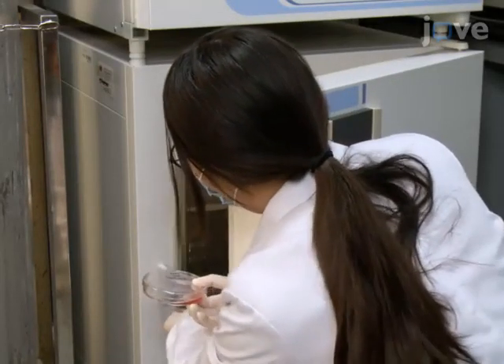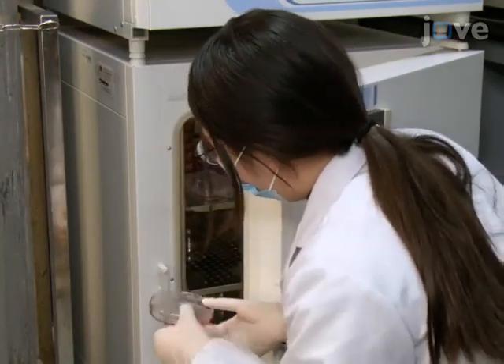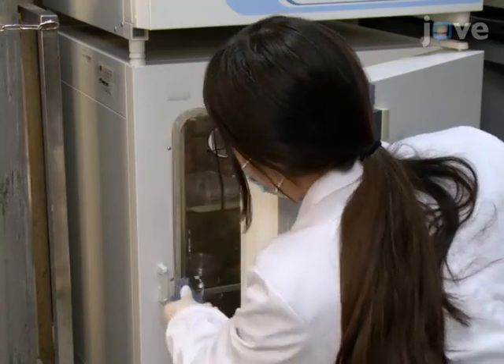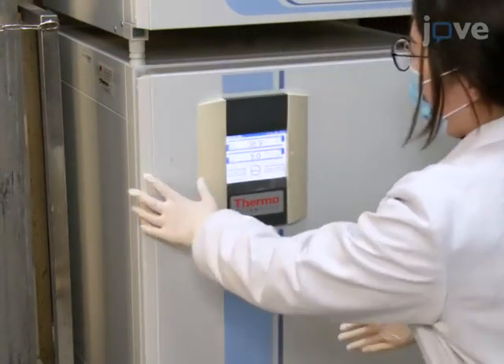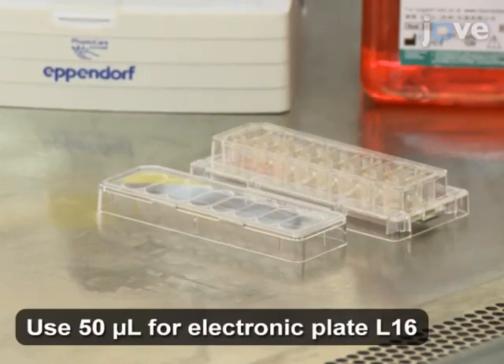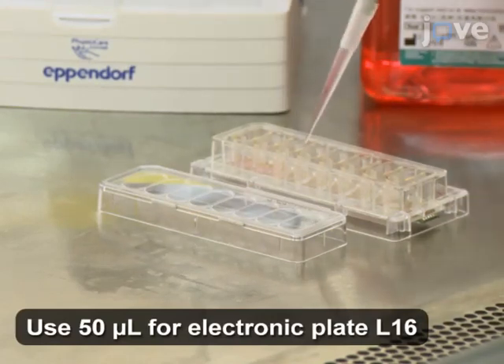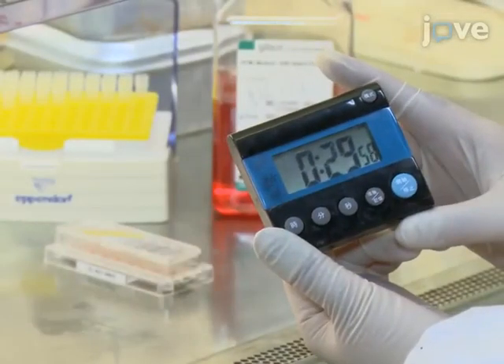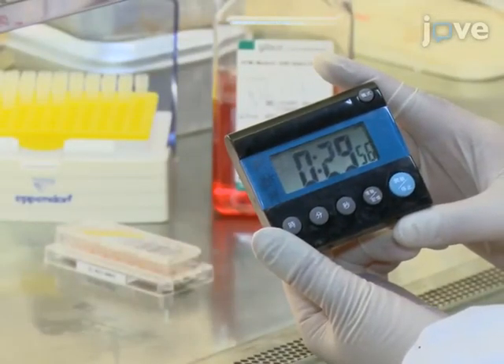Let's begin this procedure with incubation and proliferation of A549 cells in a cell culture dish as described in the text protocol. Add 150 microliters of cell medium to each incubation well of the electronic plate L8. Leave the plate for 30 minutes in the biosafety hood for equilibration.